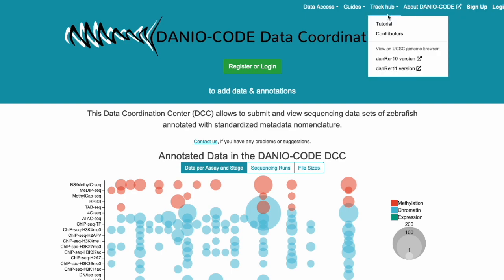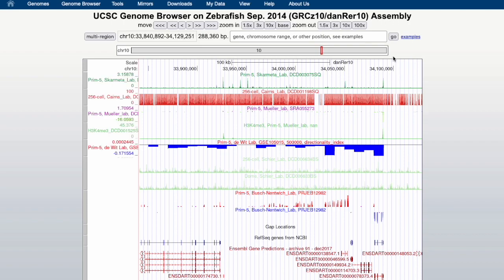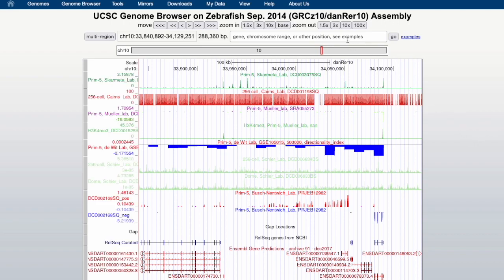One quick way to answer this question is to go to the UCSC genome browser with our track uploaded. As an example gene, we will look at the sonic hedgehog A.